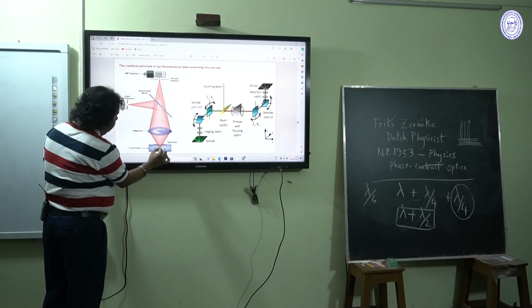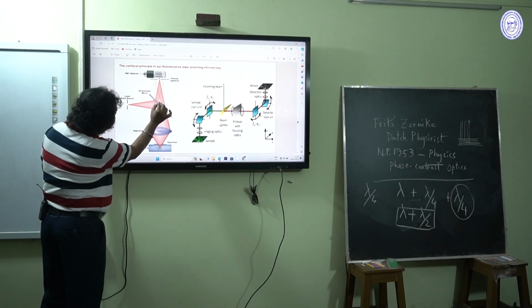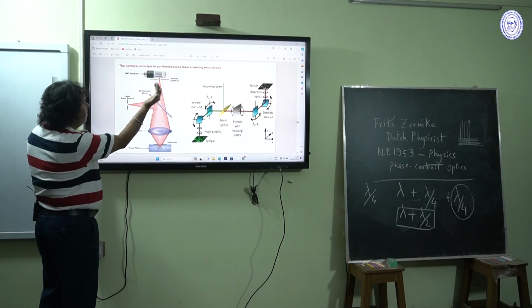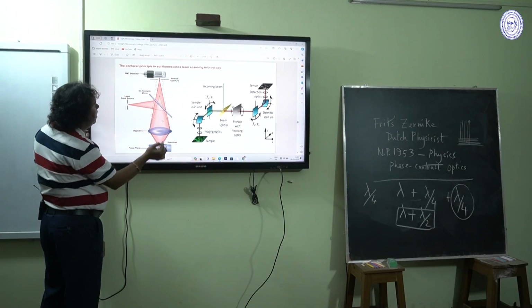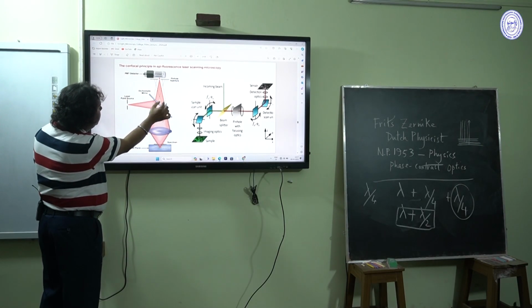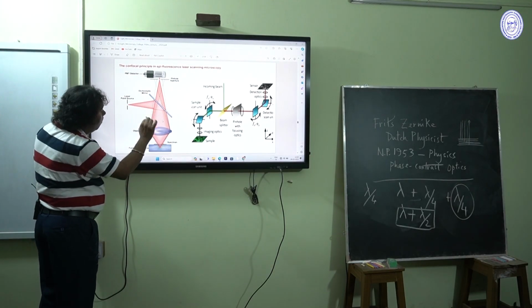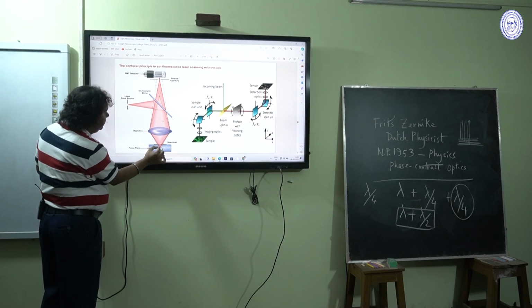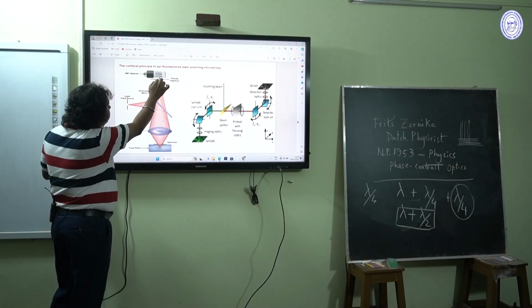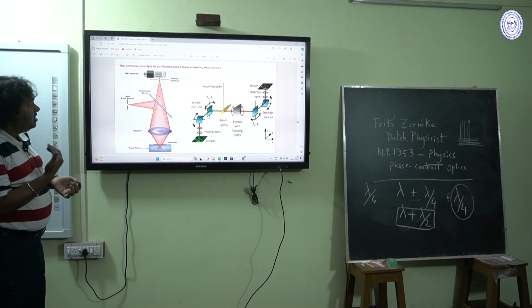The green light coming from a different point forms its focal point in another place, apart from the pinhole aperture. So this type of light or image is discarded as noise. Only the light that forms a confocal image at the pinhole will pass and create the image.